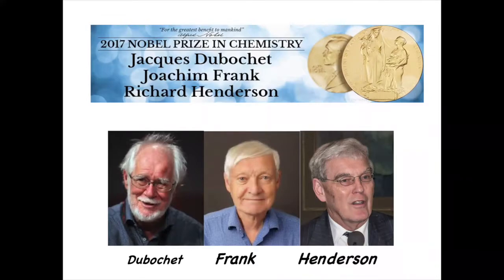The same method was actually also used for data collection by X-ray diffraction from frozen crystals. Joachim Frank was the person who pioneered the idea of using computer analysis to combine images of particles or molecules oriented in different orientations.